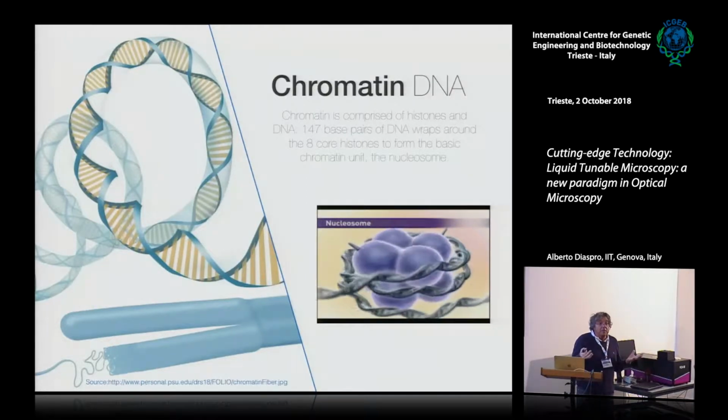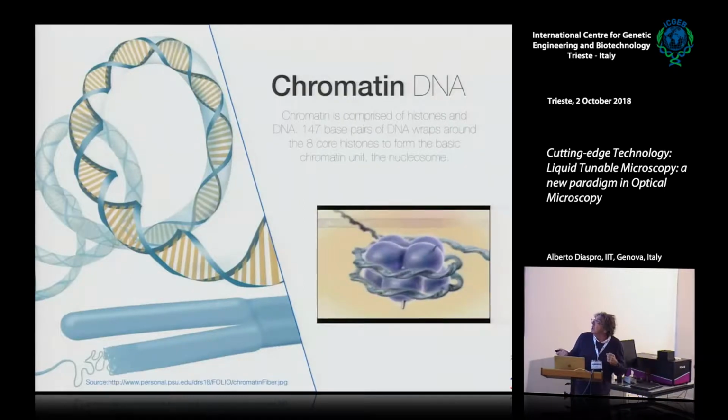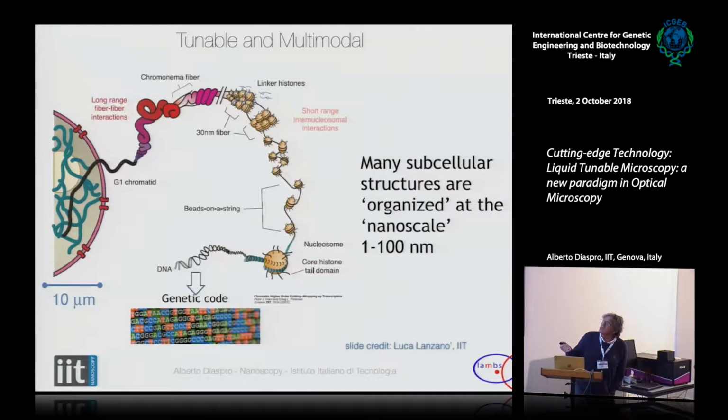El Dorado for a microscopist, because today you have a unique possibility of building, realizing, or having in your hands an instrument that allows you to follow what's going on at different levels of spatial resolution. So you can really tune across details in your sample using the very same instrument. That is carved glass, a piece of glass, so a lens, and visible light. So the idea is to be able to tune here.